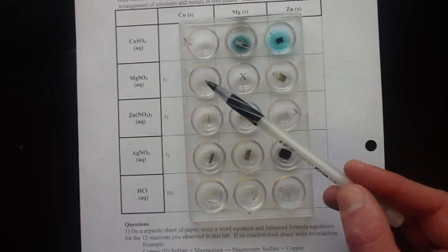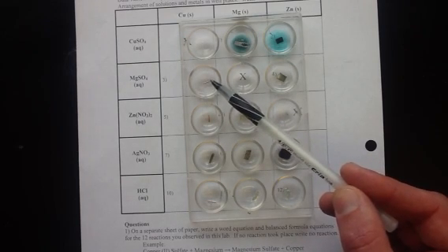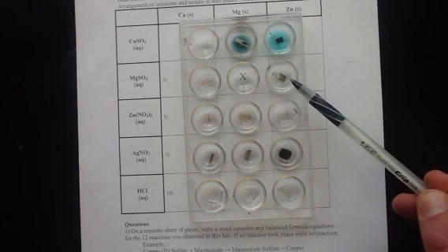In this row with the magnesium sulfate solution we have no reaction. The copper metal is just as it was sitting in the magnesium sulfate solution. In this box right here we also have no reaction taking place - the zinc metal is unaffected by the magnesium sulfate solution.